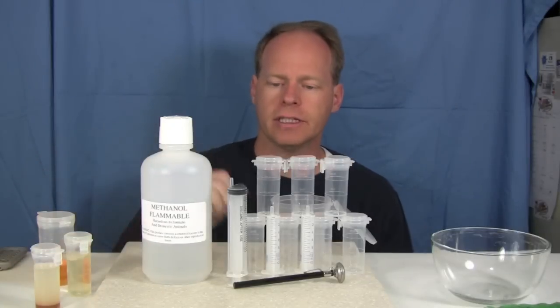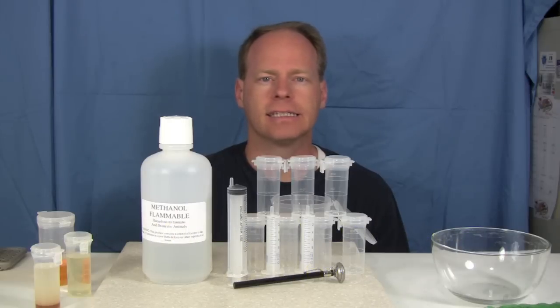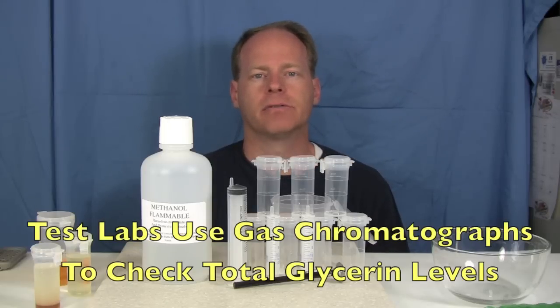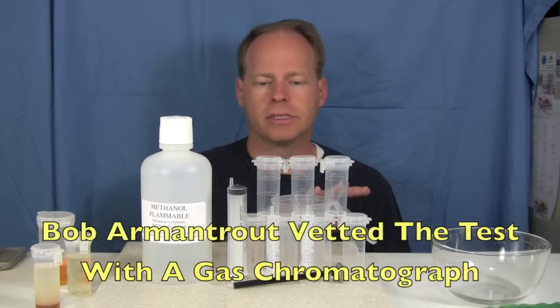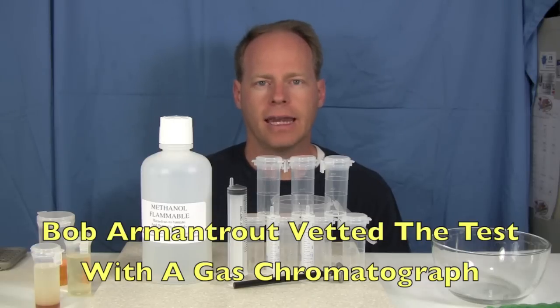The history of this test came from someone over in Europe that figured this out one day, and a group of people in the United States decided to see how accurate this test was. In a biodiesel lab, if you were to send your fuel in to be tested for total and free glycerin, they would put it in a gas chromatograph. A bunch of people sent in samples to a friend of mine, Bob Armantrout, that had a gas chromatograph.